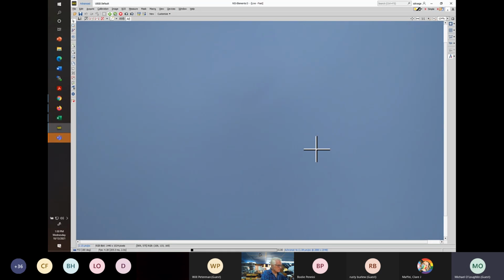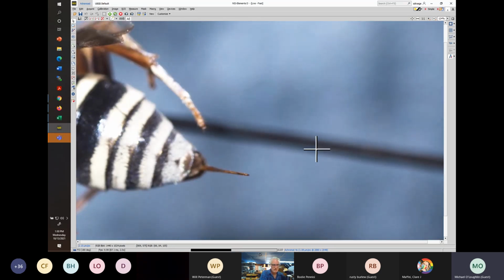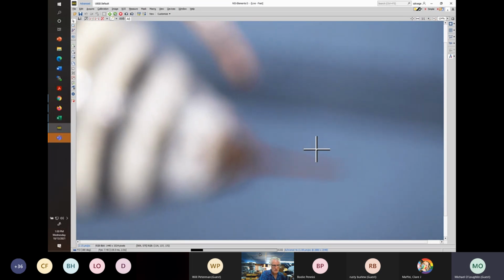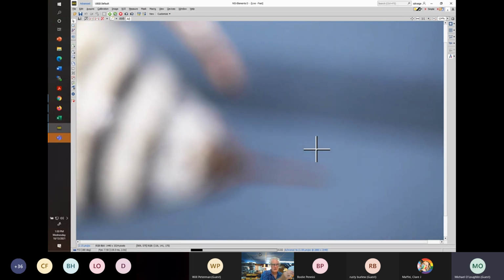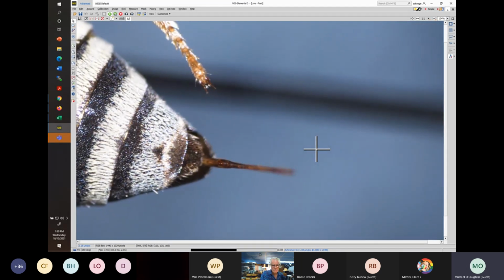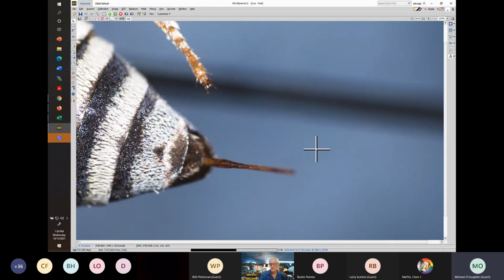But now let's go to the female Epeolus scutularis in this case, and we will take a look at, not the tooth, but the rear end of this thing and talk about the pseudopygidial area, which is more visible here, and the odd projections coming out of either side of the sting. All right, so the key here is that here's the pseudopygidial. It just shows up better.